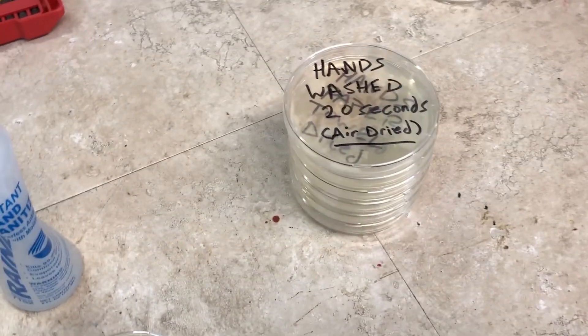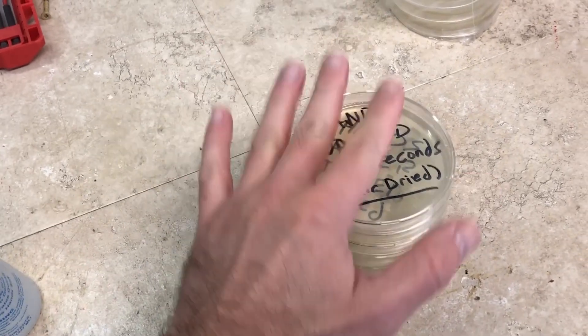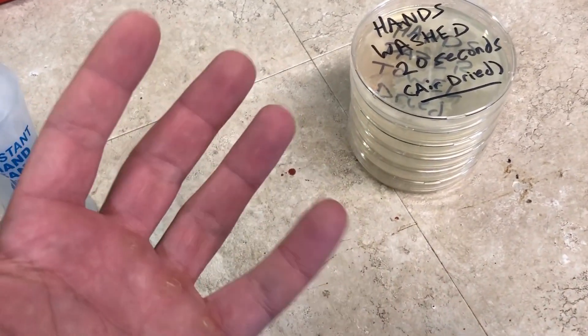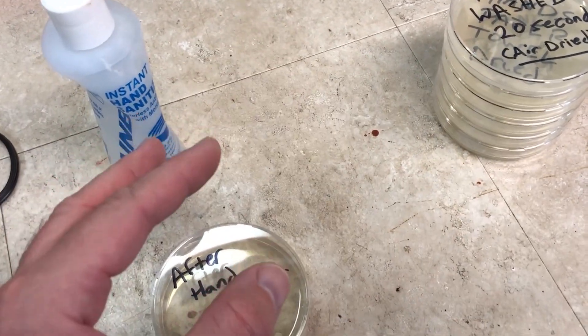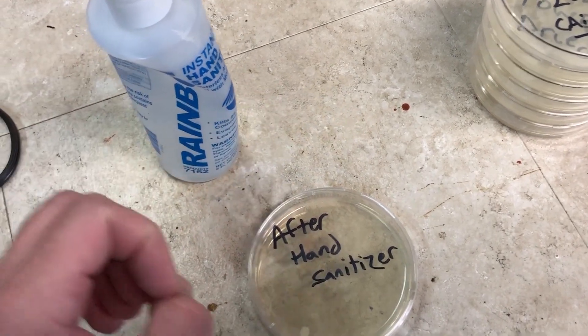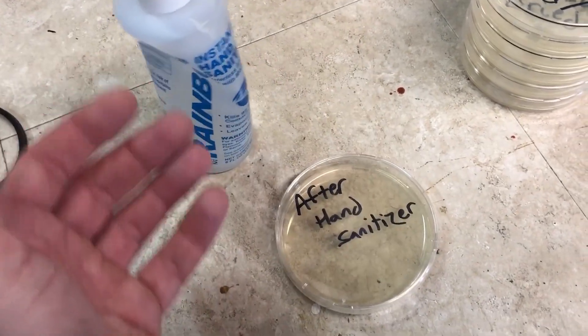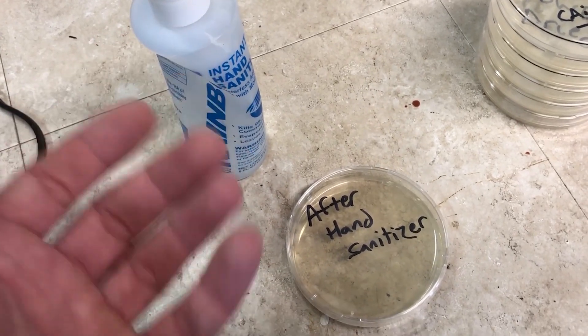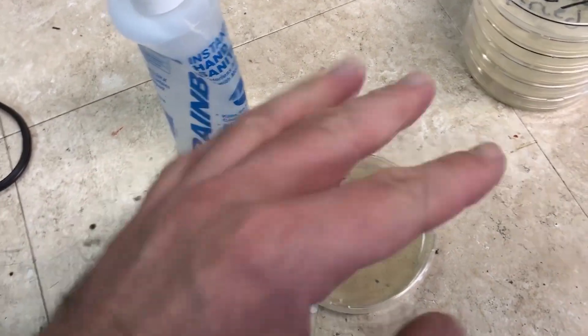Here is my stack of petri dishes going into the incubator, but before we do that, I'm adding one more. I've touched a lot of stuff since I washed my hands. I'm using this 60% alcohol hand sanitizer, and after cleaning my hands with it, I'm going to touch the agar plate directly without touching anything else.